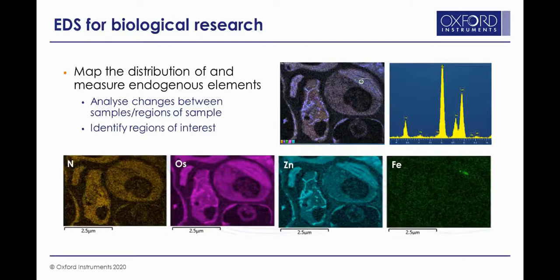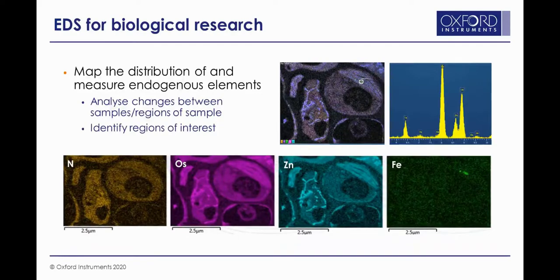Here is another example — again plant cells, stained with osmium and zinc as seen in the maps. This shows where you can find specific regions of interest; in this instance, a concentration of iron in the chloroplast, which is a relatively rare occurrence but can quite clearly be identified using EDS.